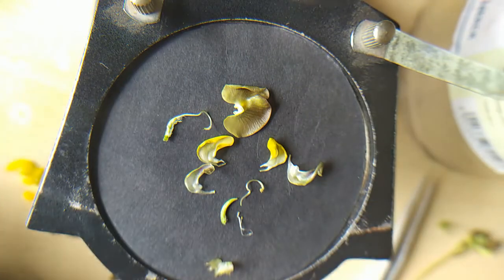So this is the dissection of green gram. The arrangement is the same as that of the urad bean. Thank you.